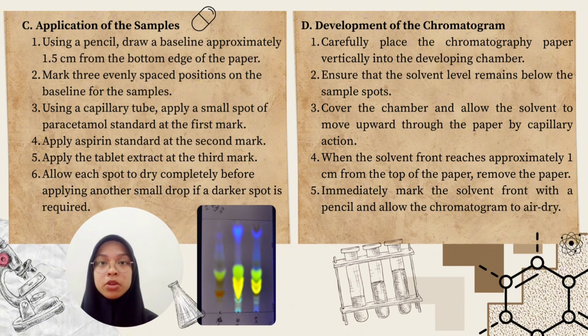Next is the development of the chromatogram. The chromatography paper is placed vertically into the developing chamber, making sure that the solvent level remains below the baseline.